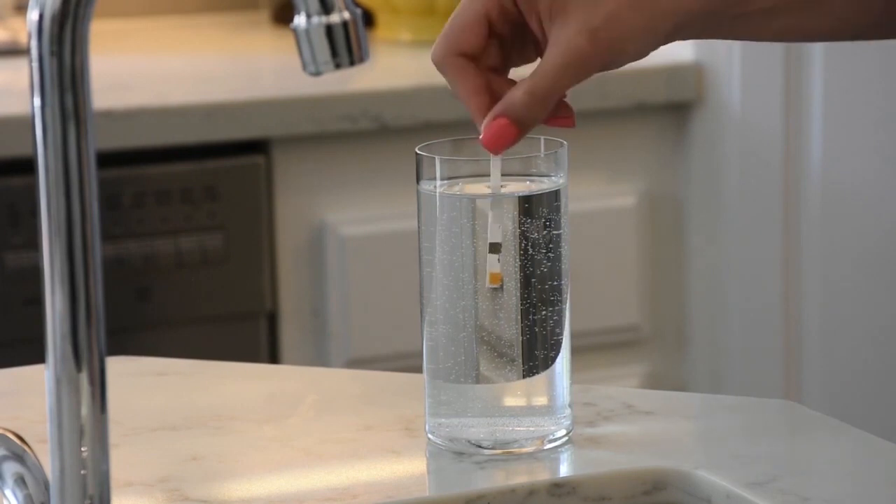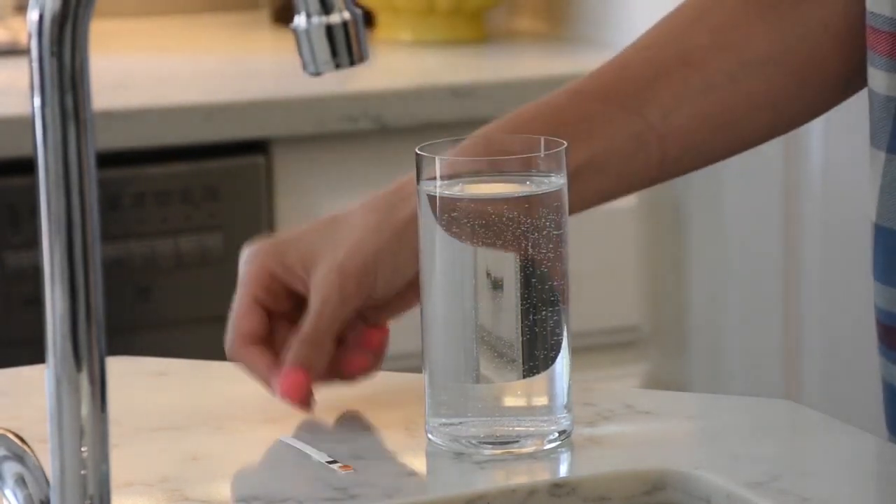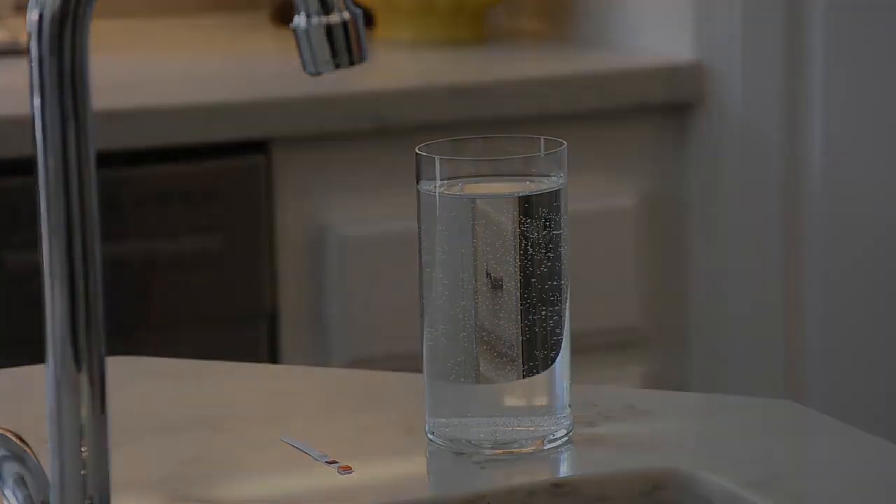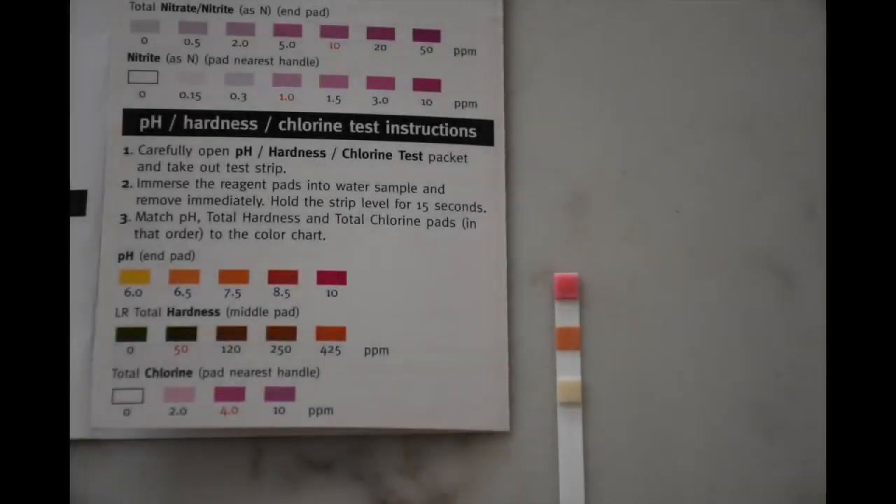Remove the strip and immerse the reagent pads into a water sample and remove immediately. Set the strip down on a flat surface for 15 seconds. After 15 seconds, colors will appear on the strip. Refer to the instruction leaflet to interpret the results.